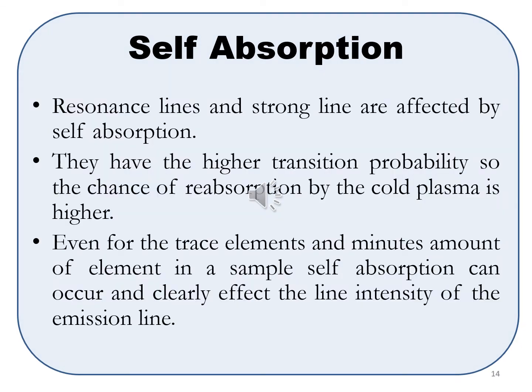Normally the resonance lines and strong lines are affected by self-absorption. They have a higher transition probability, so the chance of reabsorption by the cold plasma is higher, even for the trace elements and minor amounts of elements in a sample. Self-absorption can occur and clearly affect the line intensity of the emission lines.